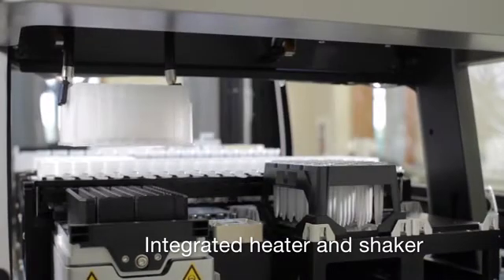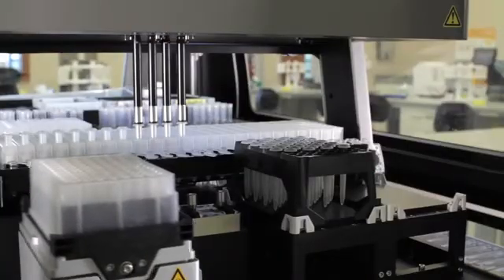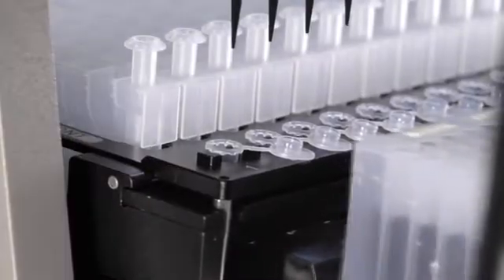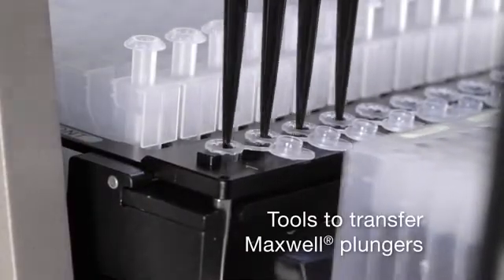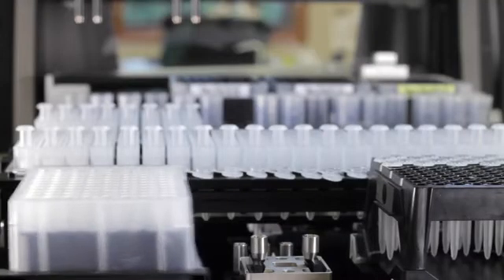The instrument efficiently completes additional Maxwell cartridge preparation steps such as placing plungers and filling elution tubes while incubation is occurring. Specialized tools allow the pipetting channels to automatically place plungers directly into the Maxwell cartridges.